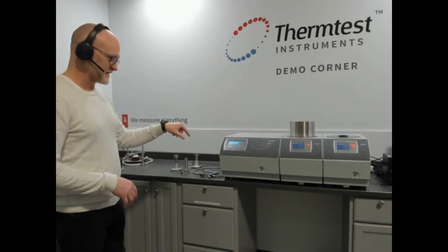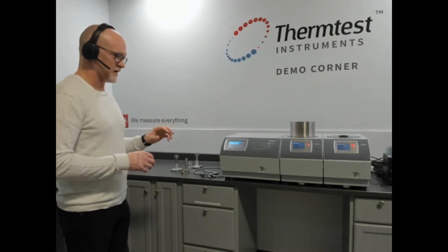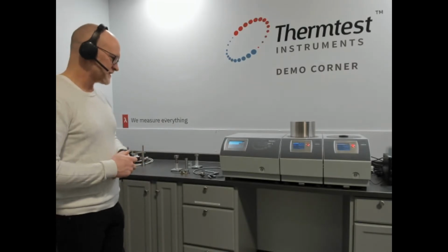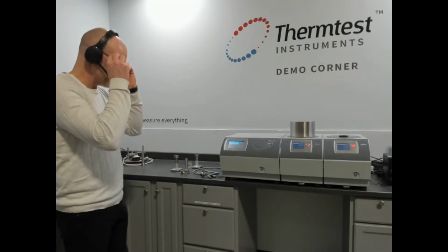The other method we've recently added to the MP-1 is the transient line source. So really there's quite a few capabilities within this technique. And that was always the intent, the MP being something that is modular that we can build onto.